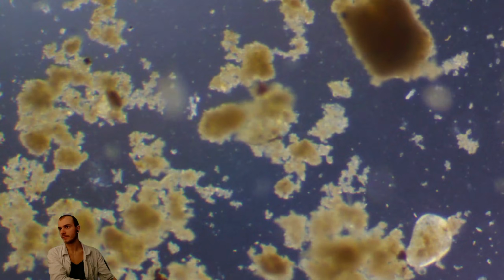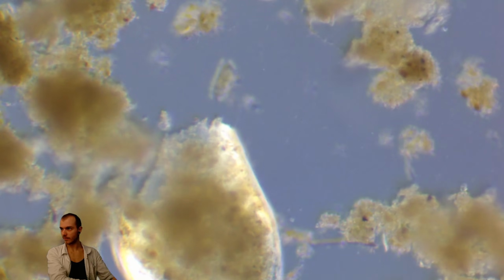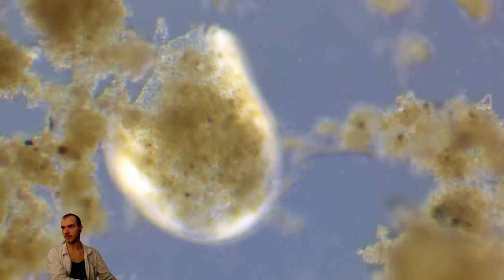I already noticed some skeleton from an ostracod somewhere, but I'm not sure where it is. Yeah, there it is. I believe this is from an ostracod.